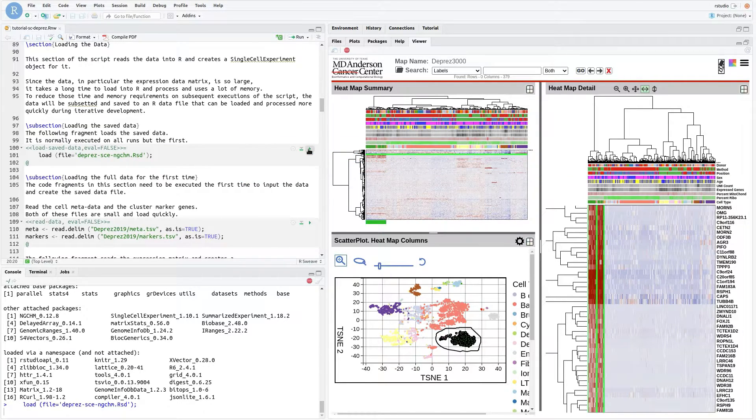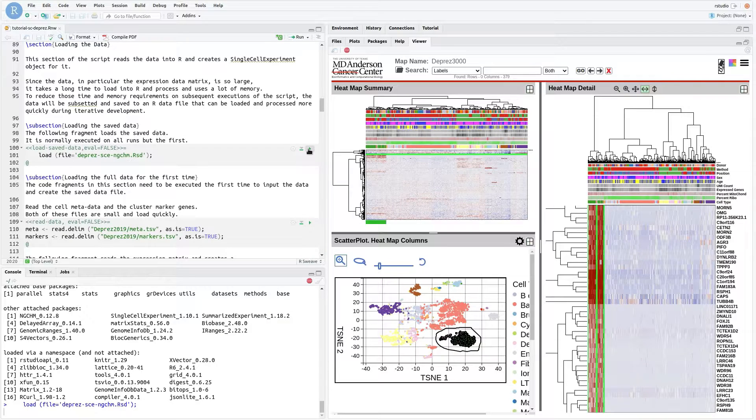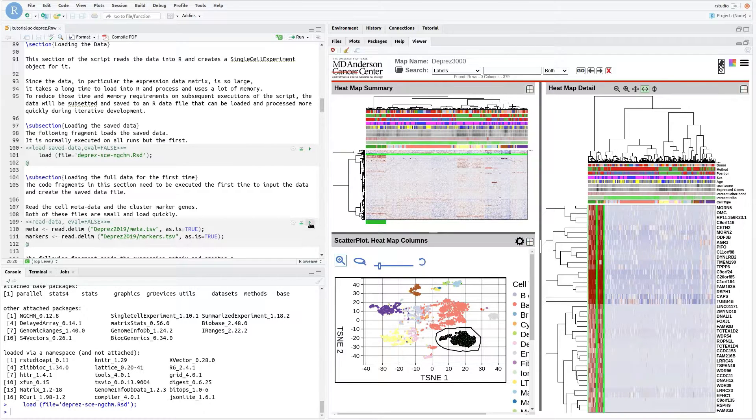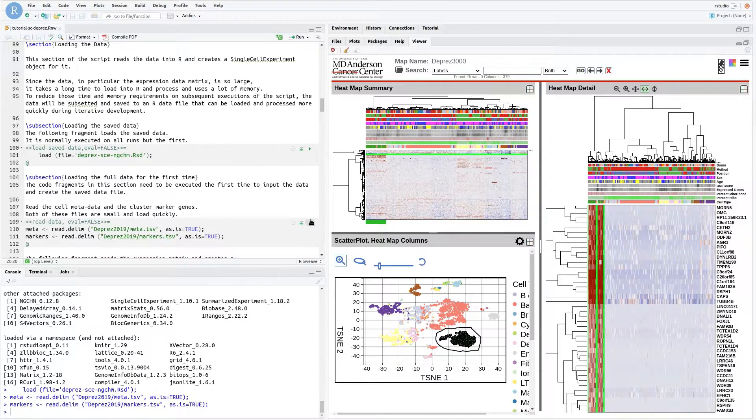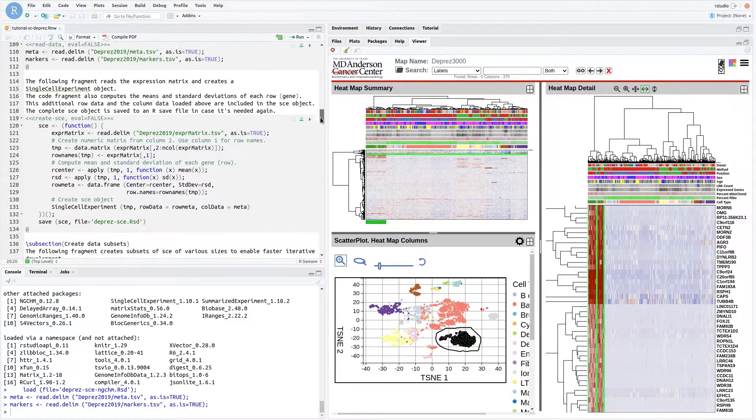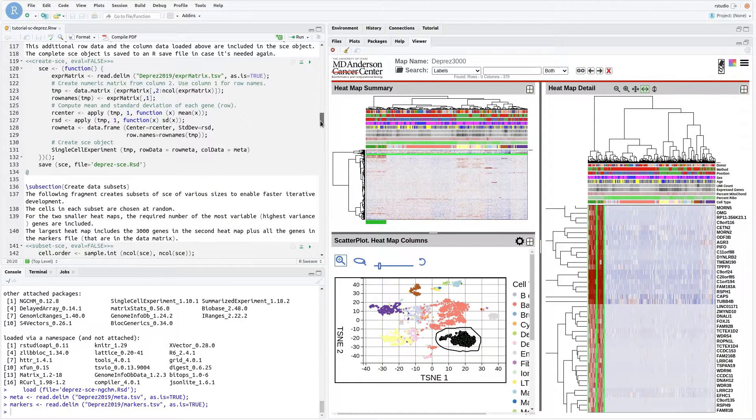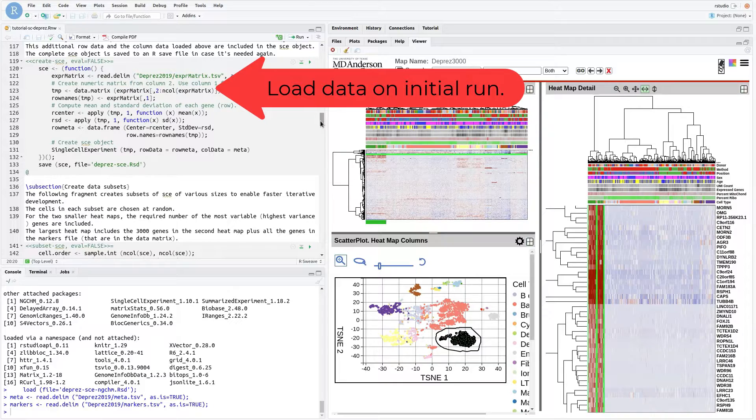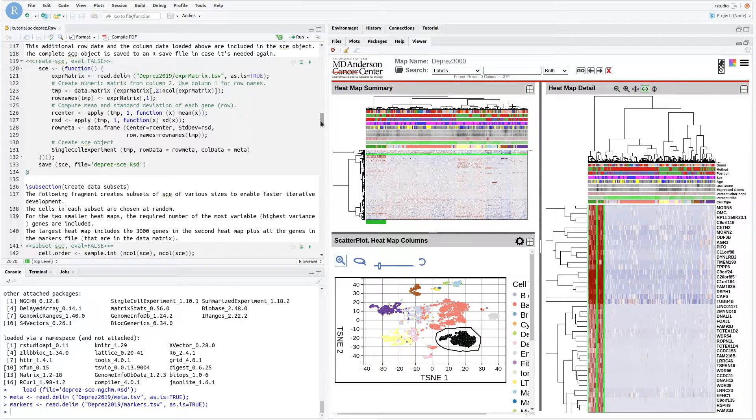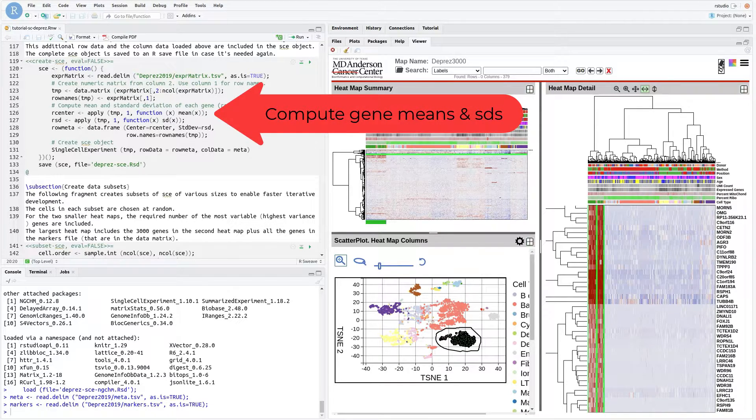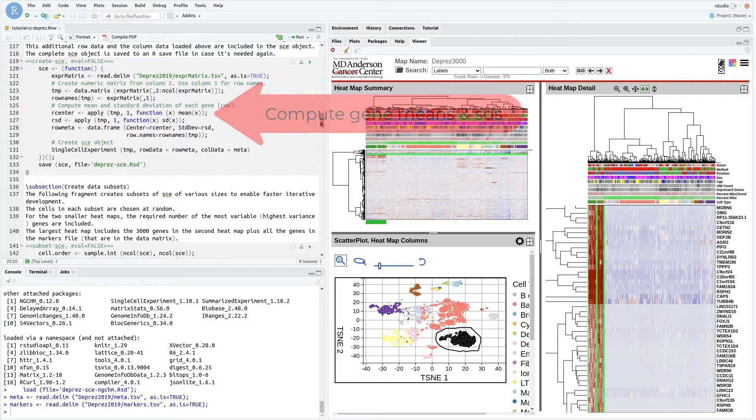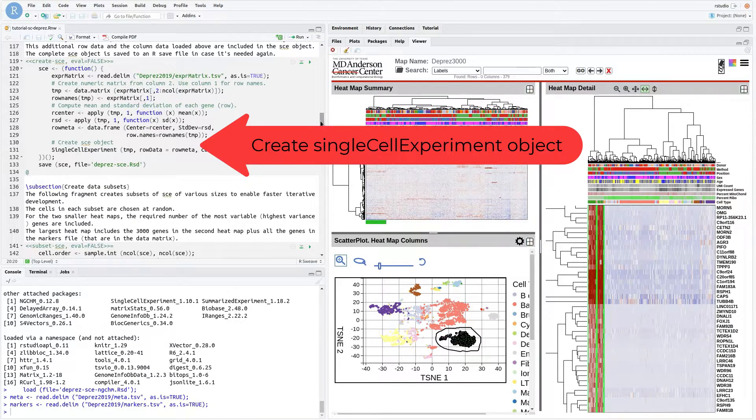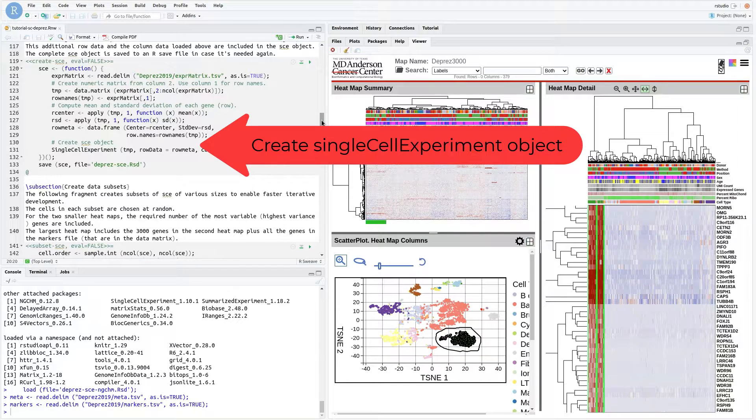On the first run, the downloaded data is input using read.delim. The metadata and marker gene table are small and load quickly. The gene expression matrix is much larger and takes a long time to load. Once it has, we immediately create a single-cell experiment from it. The first column of the loaded matrix contains the gene names. The script also computes the gene means and standard deviations and includes them in the single-cell experiment object. The object is saved to a different file from the subsetted data.